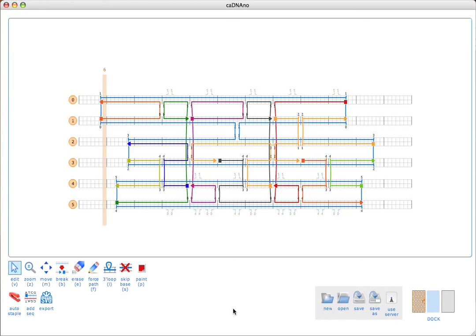If we're happy with the staple arrangement, the last step is going to be to generate our oligo list. This is done with the add sequence tool, which is down here in the corner. The add sequence tool basically applies scaffold sequence starting at a five prime scaffold breakpoint. When we do this, we'll get a pop-up window which shows us our sequences.